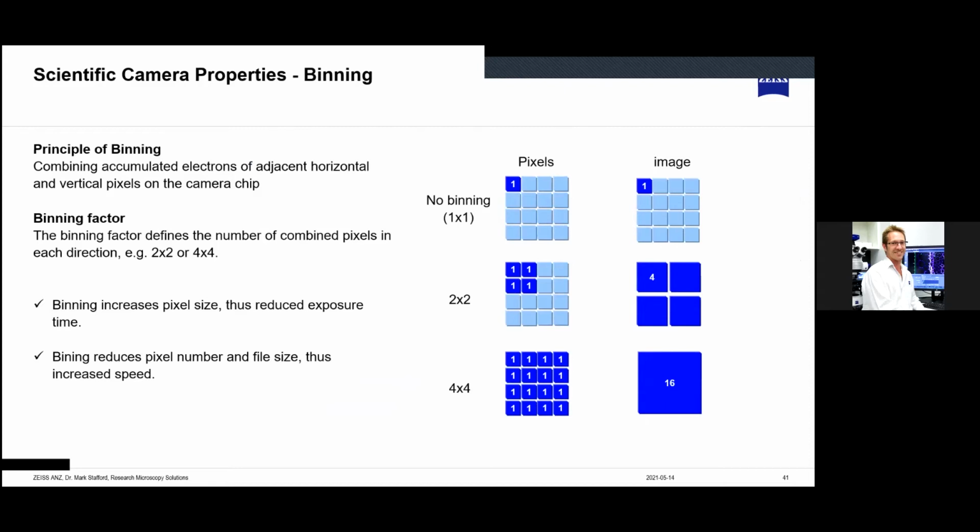Especially from the group leader's point of view, you don't want people using microscope time, paying for it, and not being able to get the data. Yeah, especially if you've done a week-long experiment, you've generated a ton of data, and then you can't deconvolve it later because you used the wrong objective or the wrong camera parameters.